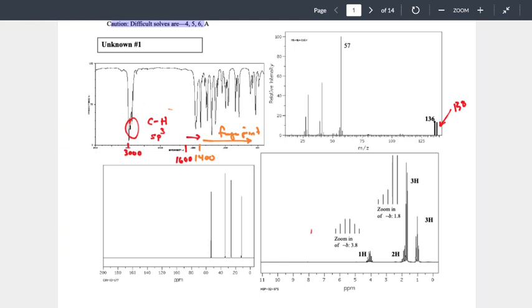That was 45 minutes later. So we got more information out of it than we got out of IR, so it took a little bit more time to process. Cool. But we've now fully beat the living bejesus out of our mass spec. If we had tried to take all of this information on our work document and put it into our spectra, that would make our spectra look really messy and nasty, and again, hard to organize and think through. Again, why I prefer the document. Make sense? Don't worry, only an hour.